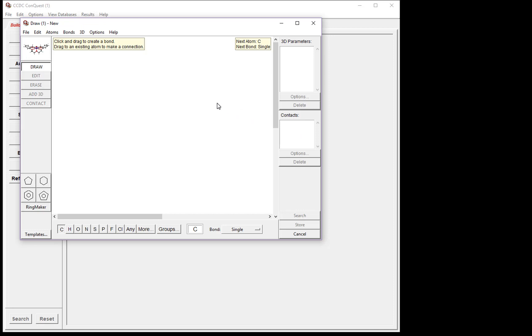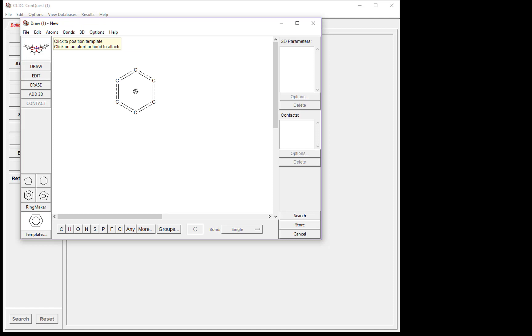First, we need to sketch our molecules. To start the sketching, click the Phenyl Ring in the Templates menu. Now click anywhere in the Draw menu. Now we have a Phenyl Ring.